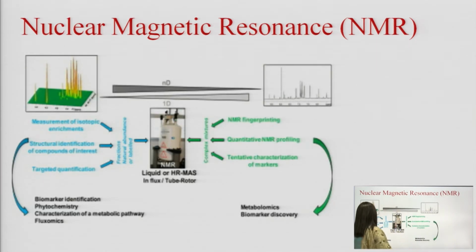This is another illustration, the look of an NMR instrument is something like this. Inside there are electromagnets, and samples are put from above. So, the peaks which we record are a representation like this. With every peak you will find some singlet, quartet, doublet type of representation. Every peak will have one big peak, and with this the deduction is done.